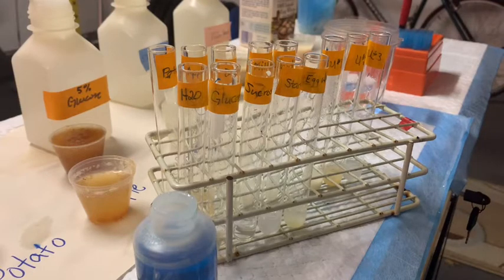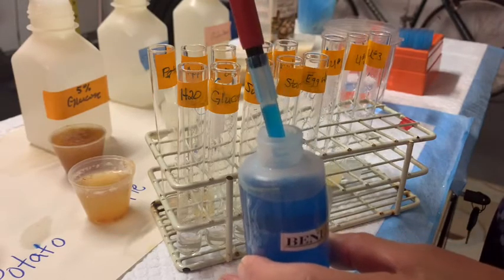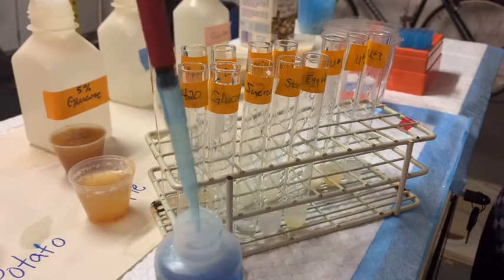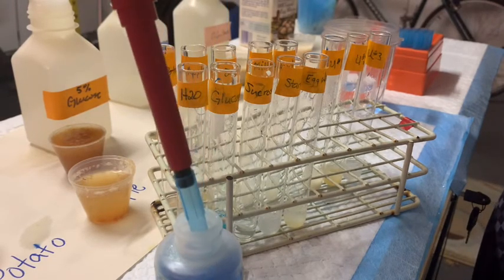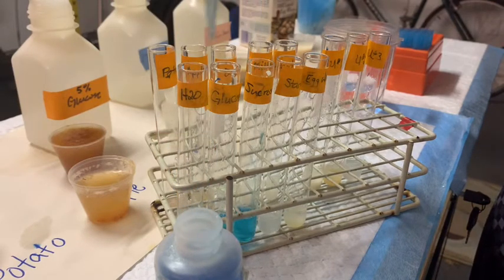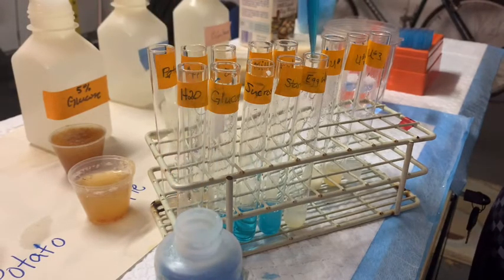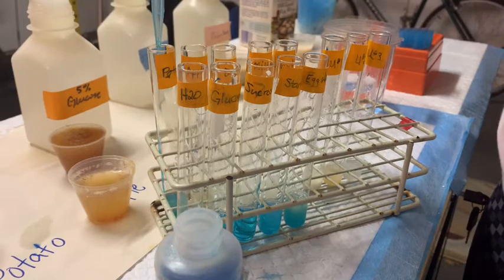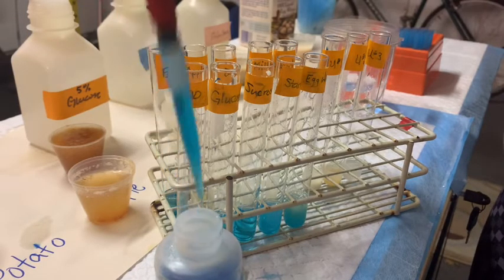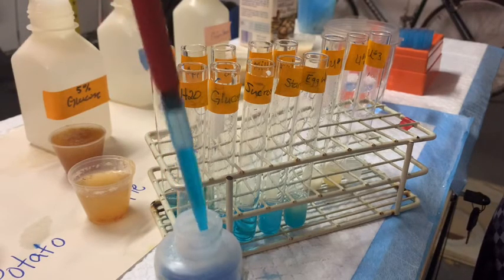We're going to add one mL of our Benedict's reagent to each one of our tubes. You're going to notice something interesting — the color doesn't change — because we actually have to subject these reactions to heat. The heat is going to facilitate the reaction between the Benedict's reagent and the reducing sugar with a free aldehyde group. For example, heat will break up maltose into the two glucose monomers, resulting in the production of two glucose reducing sugars.